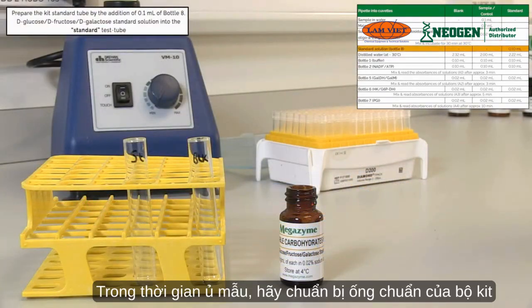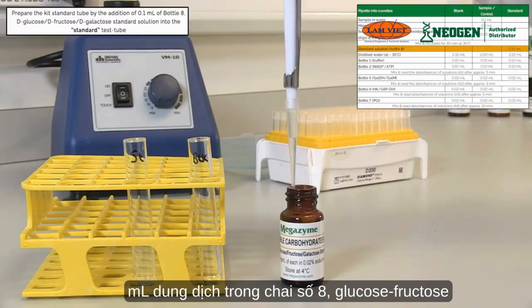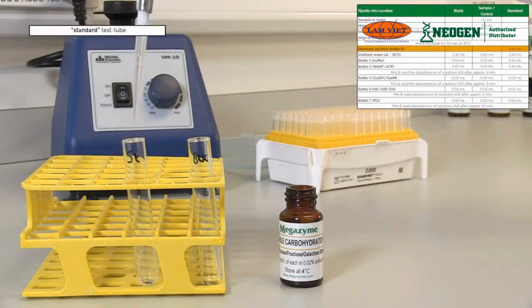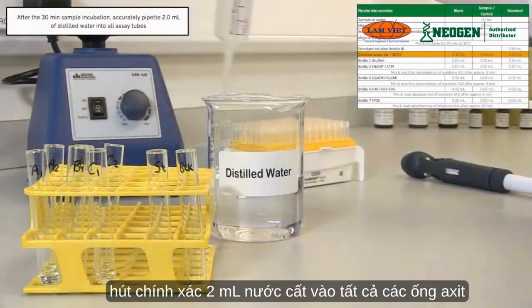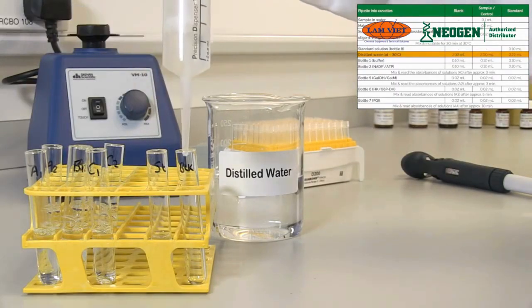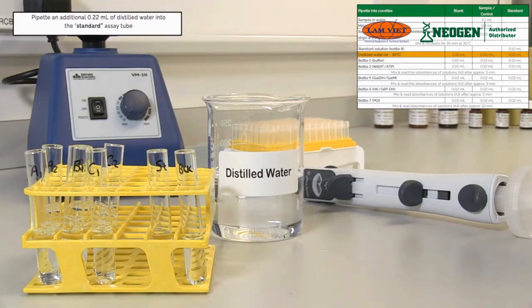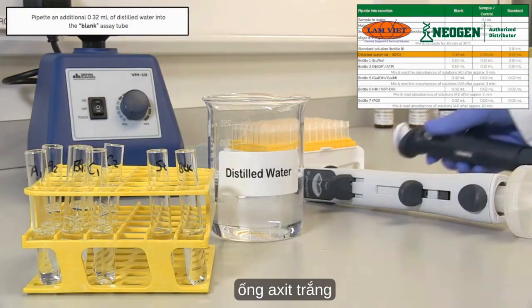During the sample incubation period, prepare the kit standard tube by the addition of 0.1 ml of the contents of bottle 8, D-glucose, D-fructose plus D-galactose standard solution, into the standard test tube. After the 30-minute sample incubation, accurately pipette 2 ml of distilled water to all assay tubes. Pipette an additional 0.22 ml of distilled water into the standard assay tube, and an additional 0.32 ml into the blank assay tube.